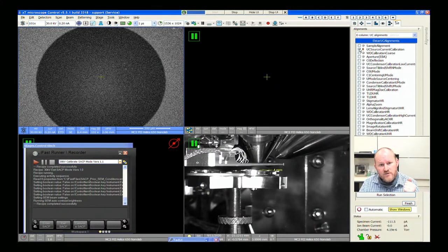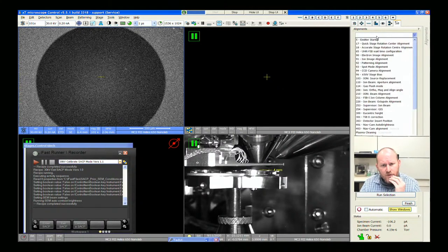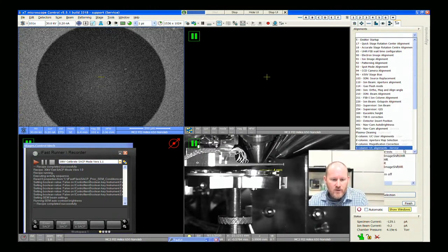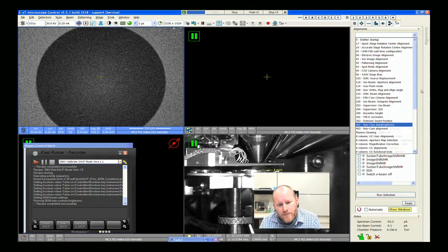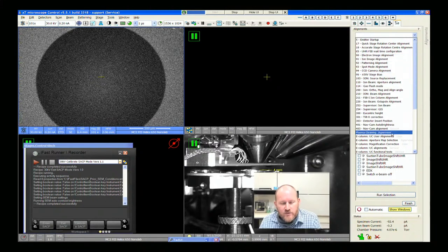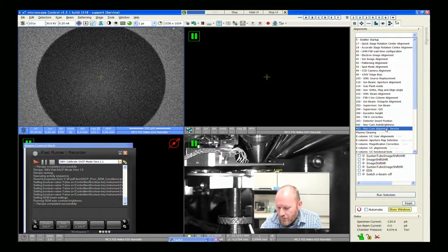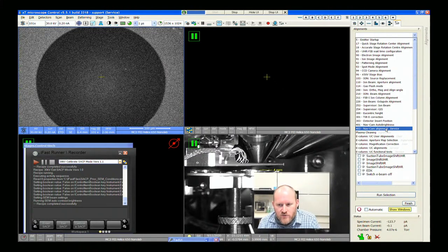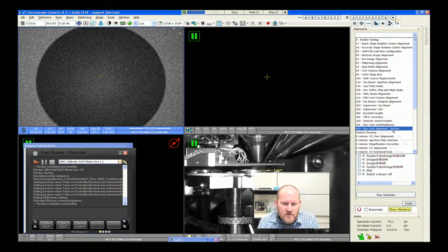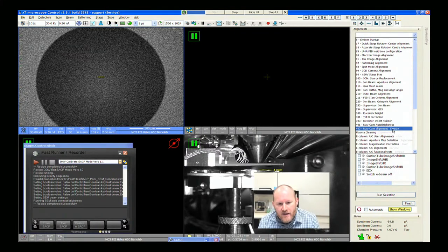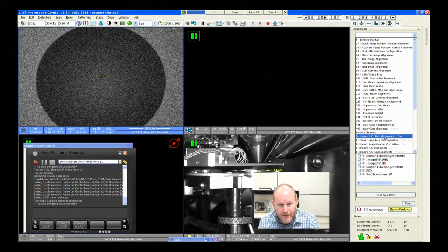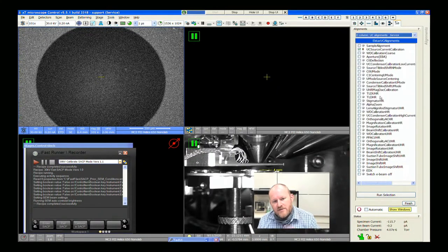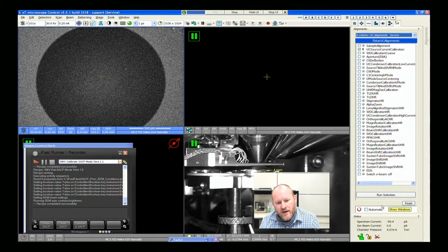The nice thing is this UC source current calibration. If you come over to your alignments tab — we are logged in in the expanded access mode, so talk to your Thermo or FEI service engineer and you can get that password from them. I'm going to this electron column UC alignments and do the UC source current calibration. The reason I do this is that it very conveniently turns C2 off, turns the HR lens off, and the apertures retract — it takes care of all three of those settings for us all at once.